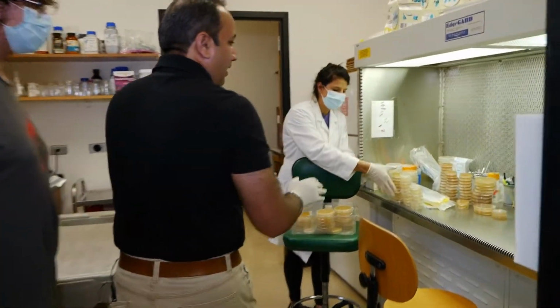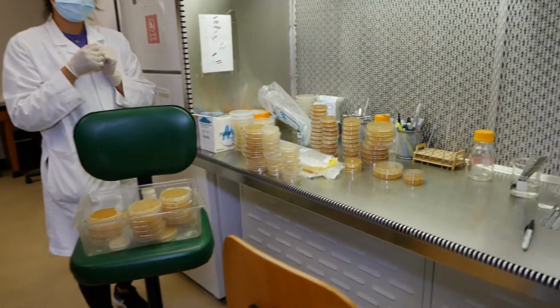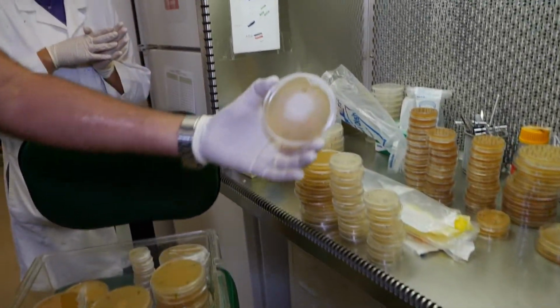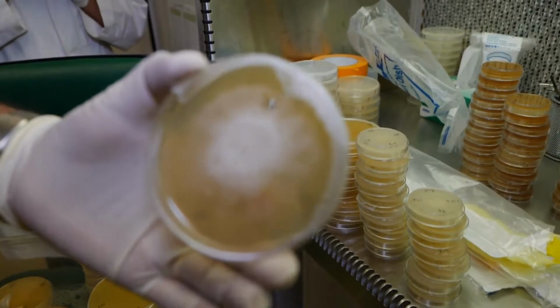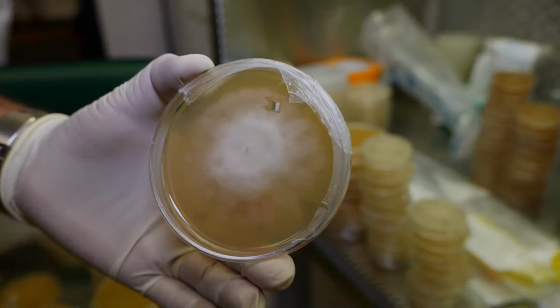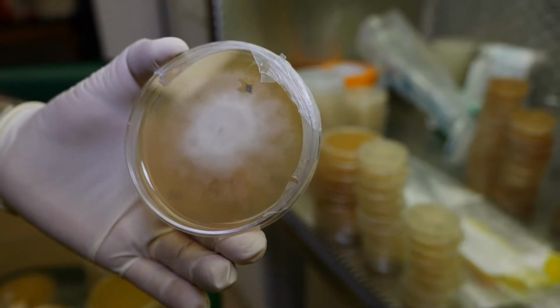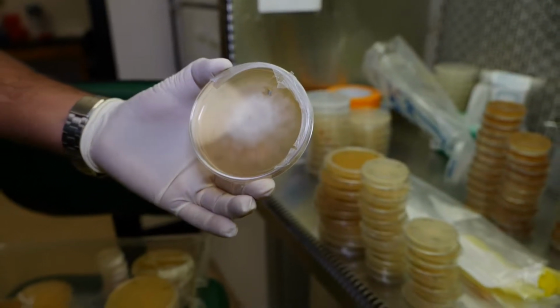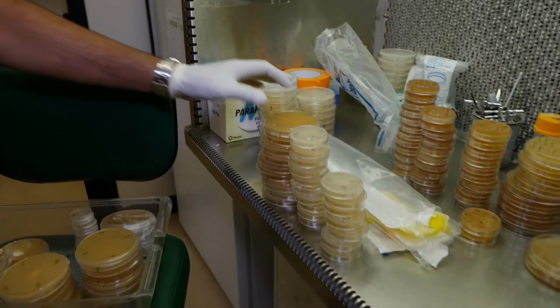So this is where we culture our pathogens. You can see here some plates that have produced the mycelium that we're looking for, the fungal pathogen. Actually, this is not a fungal pathogen. It's a fungal-like microorganism, which is Phytophthora. It's basically known as a water mold.